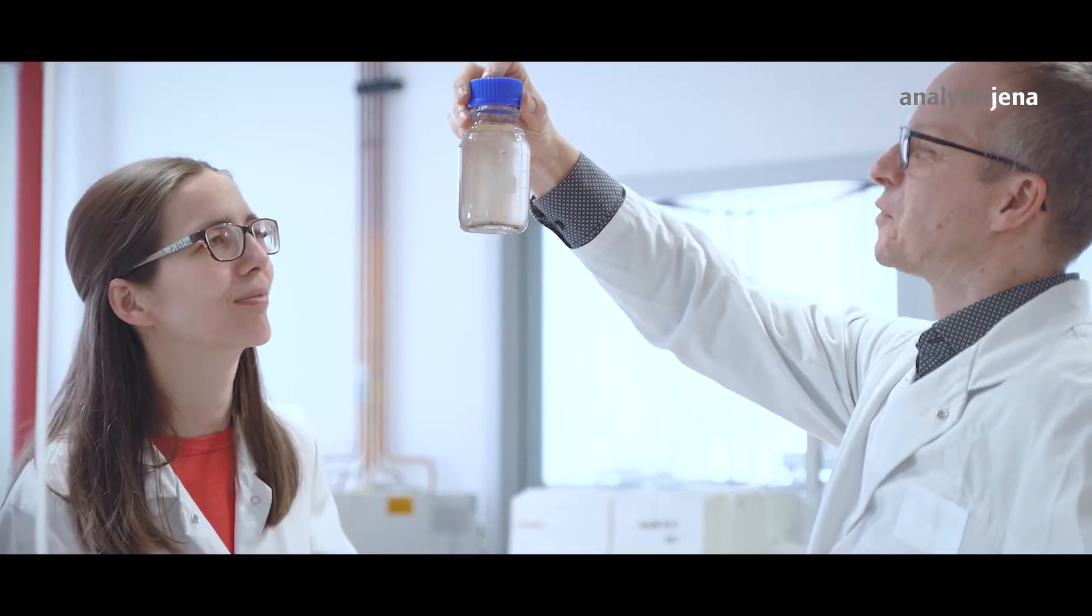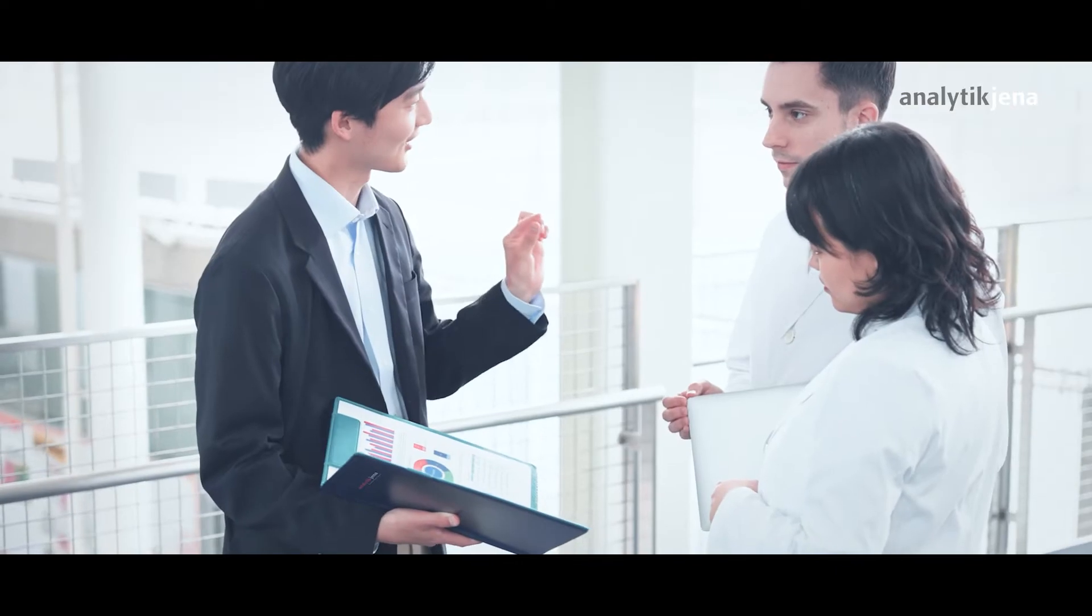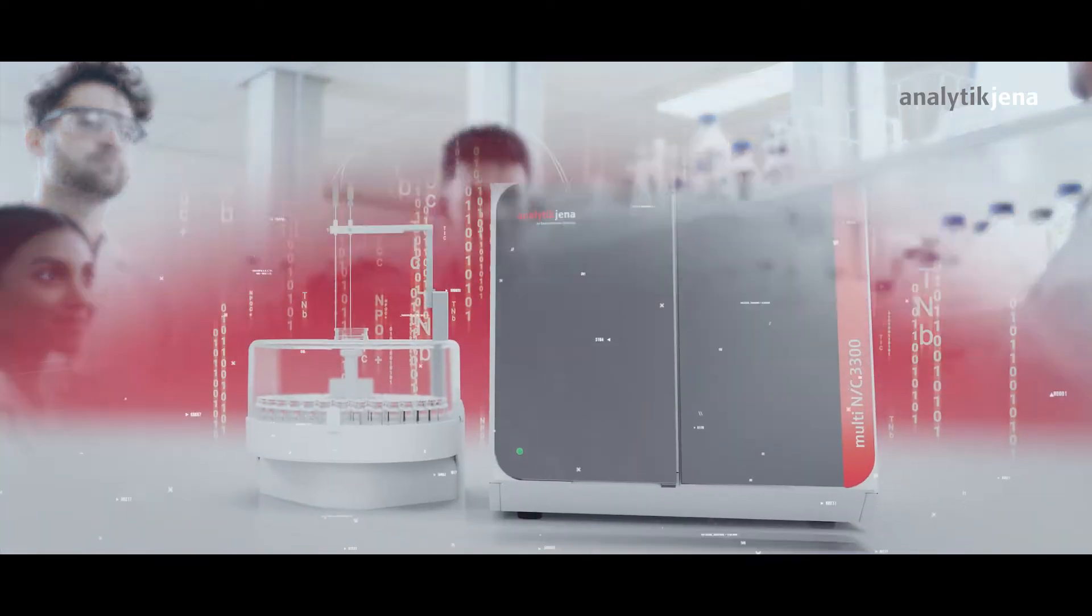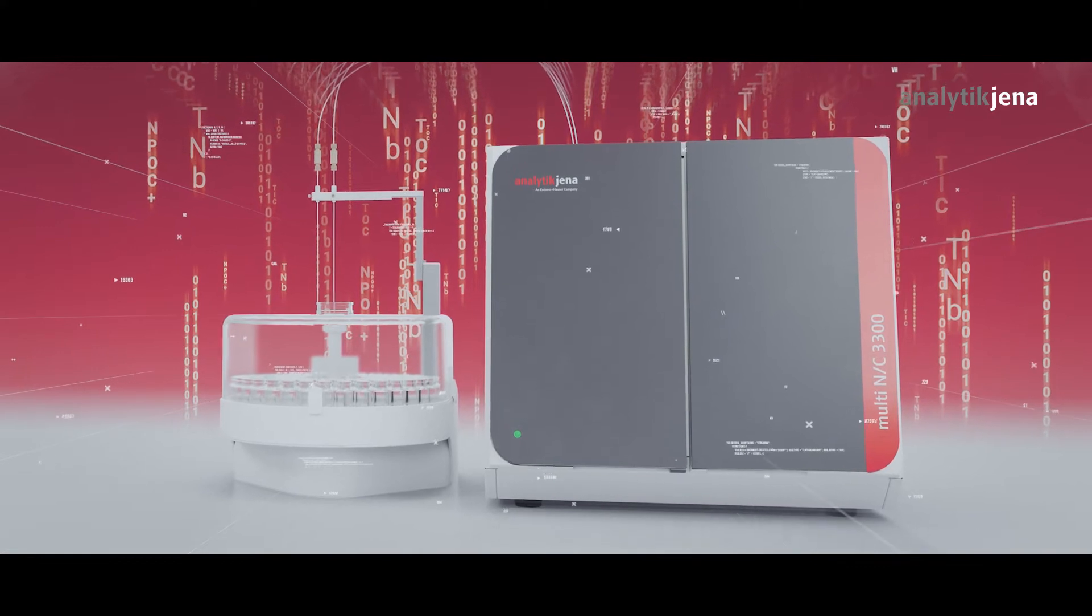Your analysis results. Your customers. Your business. Your students. Benefit from our time-saving technologies.